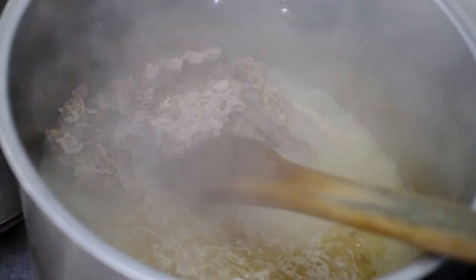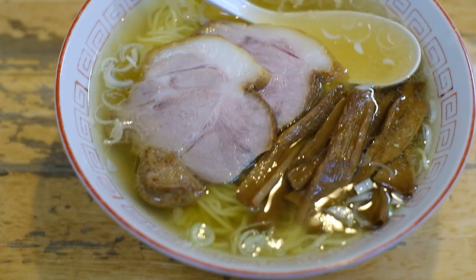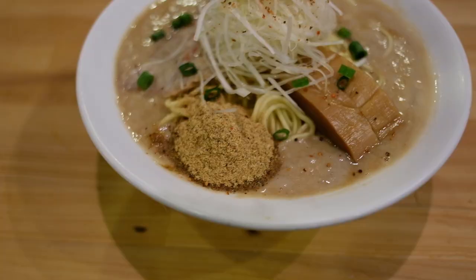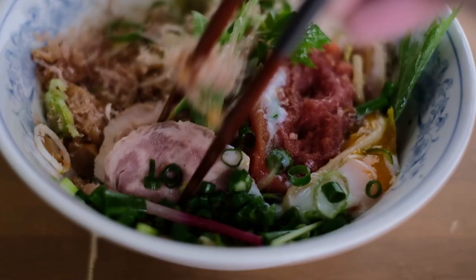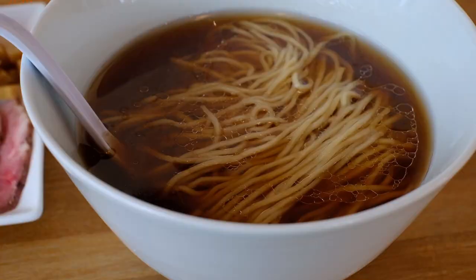When cooking up a massive pot of soup — whether it's a light chicken-based shoyu ramen or a thick pork style — many factors can affect the outcome. The quality of ingredients, the time of cooking, even the outside temperature and humidity can have an effect on a soup that's cooking for 8 to 12 hours.